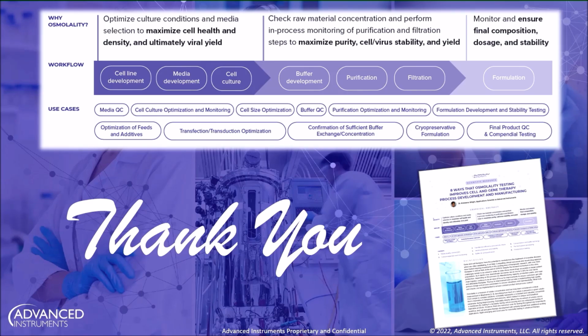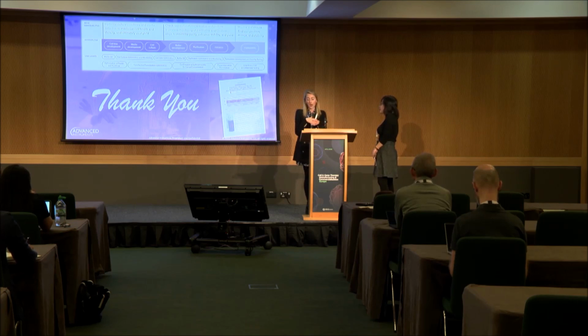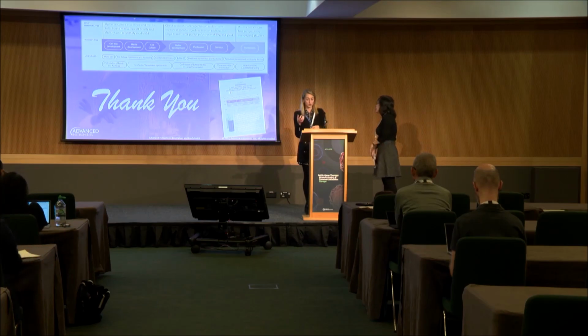My first question is, if your solution is viscous, how does that impact your osmo testing? Yes, viscous solutions in the past have really provided issues for osmometers. What we can say is that viscosity and osmolality are not linear. You could have a semi-solid gel, but your osmolality is still sitting at 300 milliosmoles, for example. So you're looking at those different molecules and those interactions rather than the concentration adding to your osmolality.